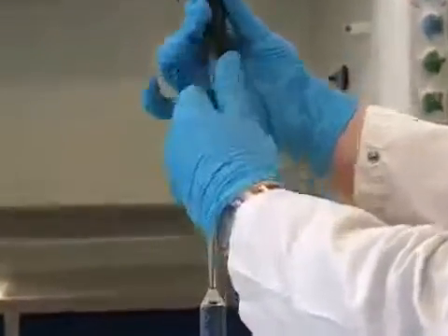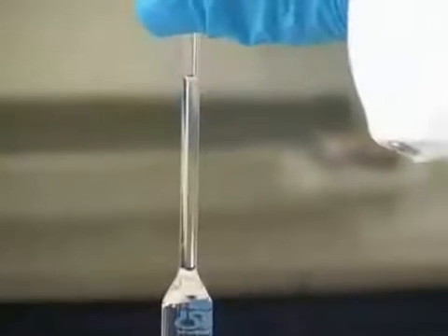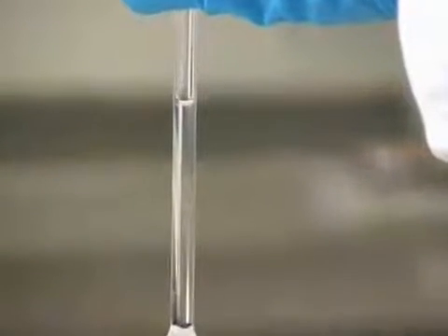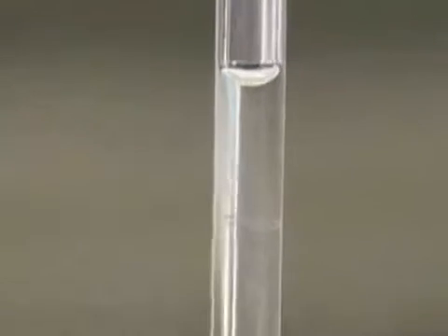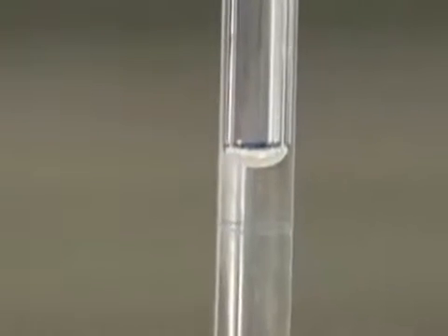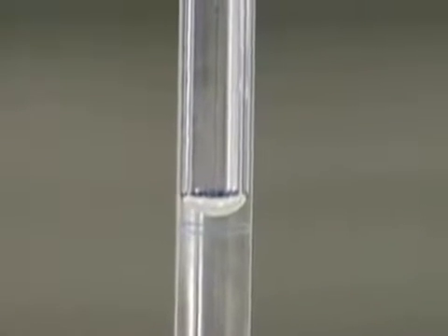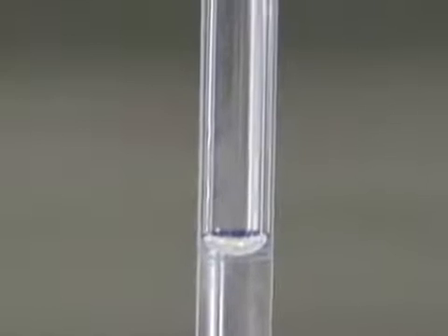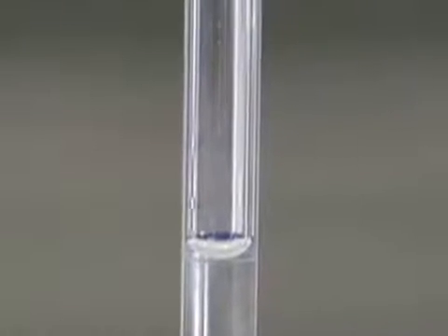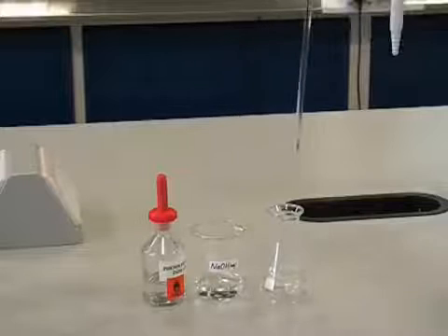Now we can gently remove the rubber bulb and we can place our thumb over the end of the pipette. Now by gently moving our thumb we can release the solution in a carefully controlled manner until the bottom of the meniscus is touching the line on the pipette. Once the solution is on the line, we know that we have exactly 25 centimeters cubed of our solution. This can now be transferred to a clean conical flask.